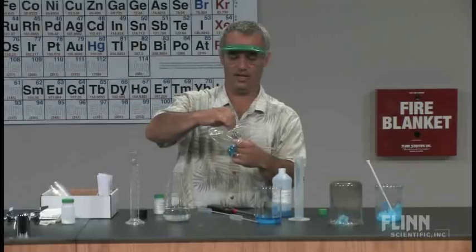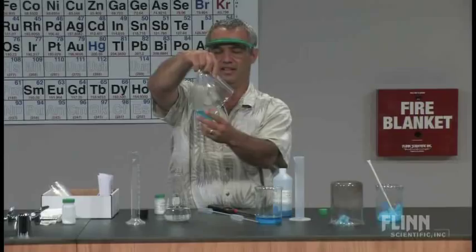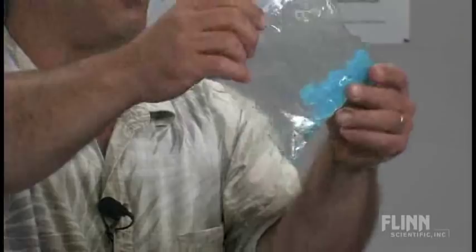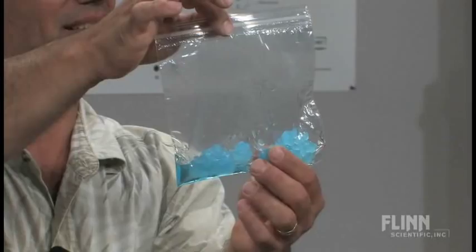Okay. And now when the two mix together, to feel, not just see, but to feel that change in viscosity as it gels up is really quite spectacular. There's not much of a change in temperature. It's not really exothermic or endothermic, but there's the Sterno right there in a bag. So much easier cleanup too. So canned heat in a bag. Thank you.